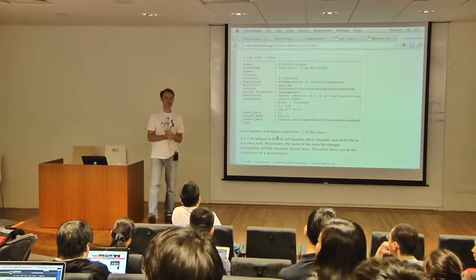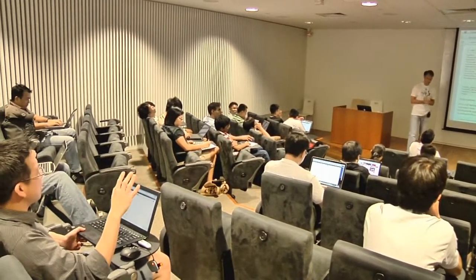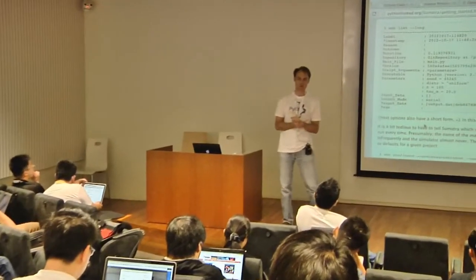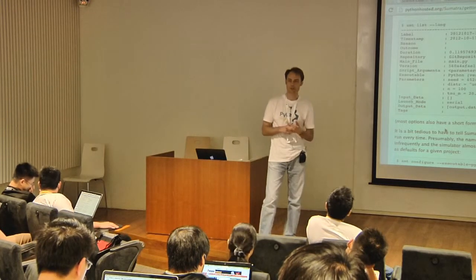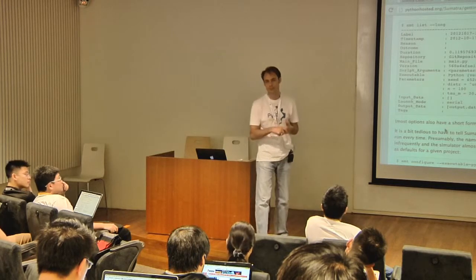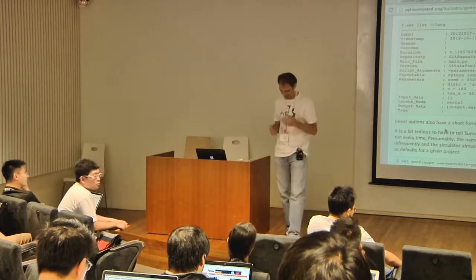Did you have to get in touch with the machine manufacturers to understand how to parse out the binary? Because presumably these are custom formats for whatever the machines are, right? Sometimes yes. Sometimes manufacturers want to open it up themselves, because if they keep sitting on the format, they know nobody will use them. So there's also a trend of people understanding you have to start opening up, otherwise you get ignored. But the problem is, we scientists, because we're not good programmers, as Marcus said, we tend to create our own formats. That's a bit of a problem.